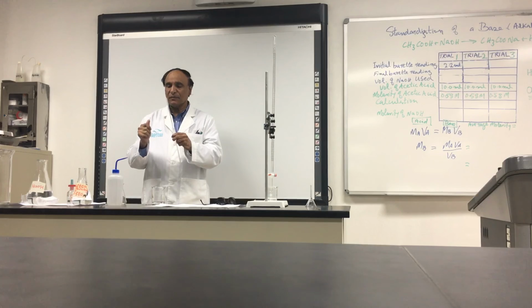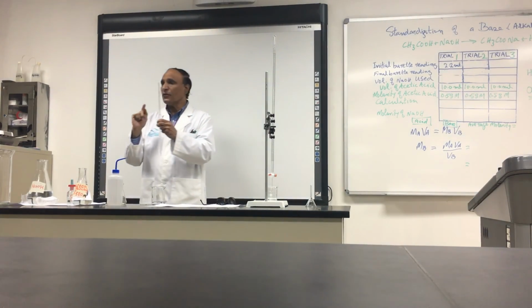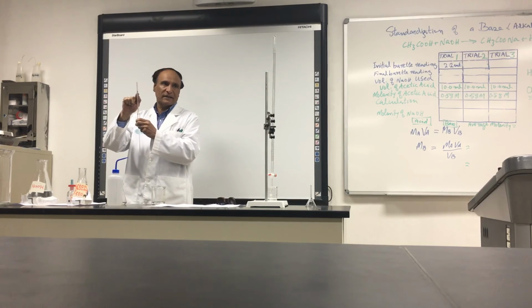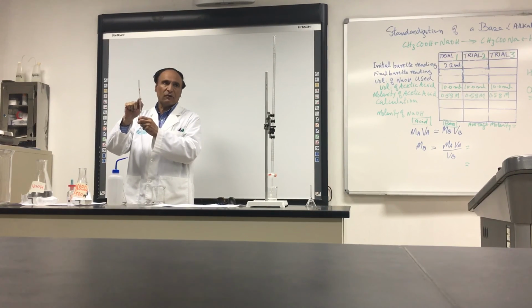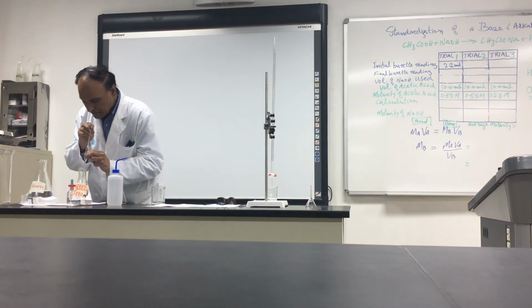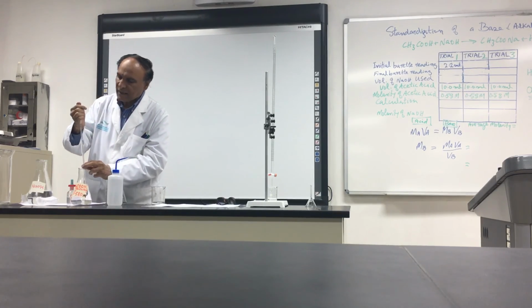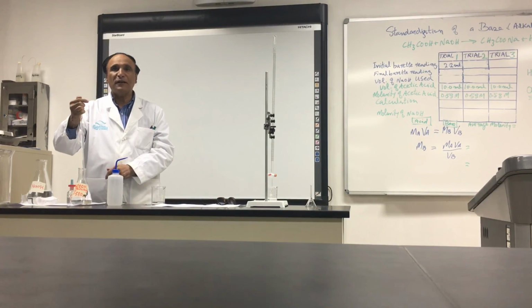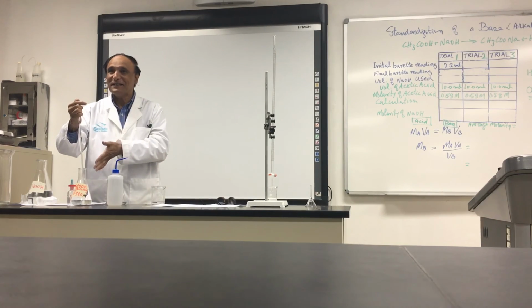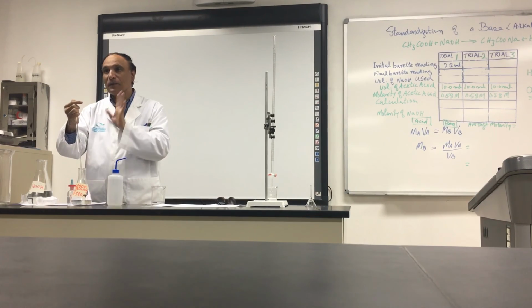I will take it up to this mark. So first of all, I will take above the mark. Then I will bring it down up to the mark. So if I take this one, like this, it is above the mark. If you drink it, no problem. This is khal, acetic acid, pure. In the market, it is not pure. This is pure, no problem.